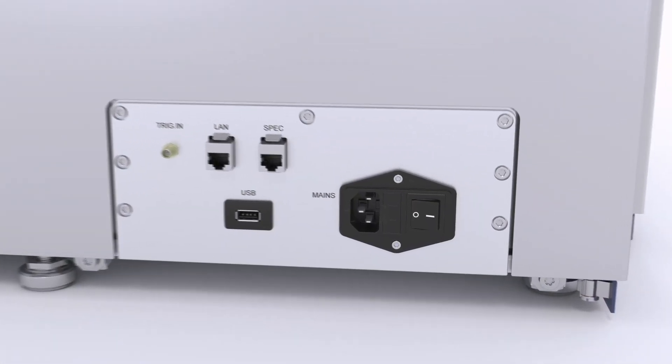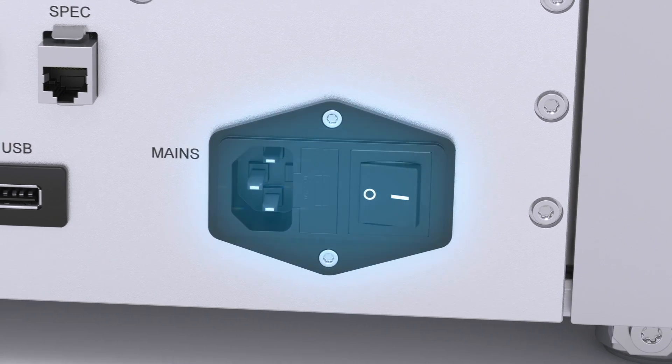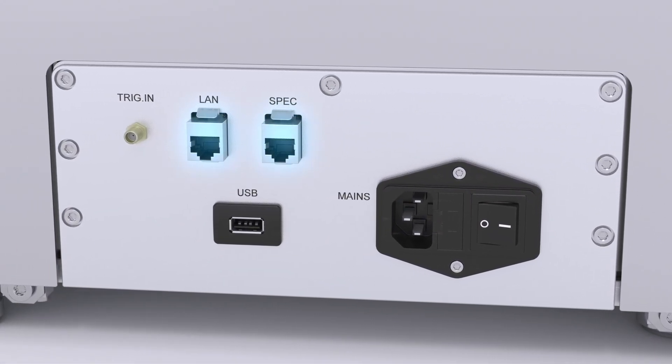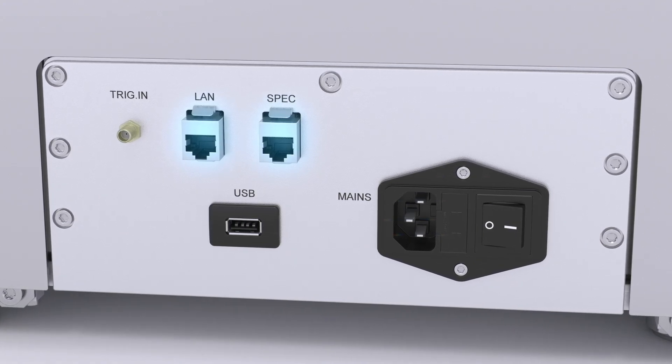On the back of the system, you can find the main connections and the power switch for the system. And in addition, the back panel provides two Ethernet connectors. One is used for the communication to the NMR PC. The other one is currently not in use but ready for future purposes.